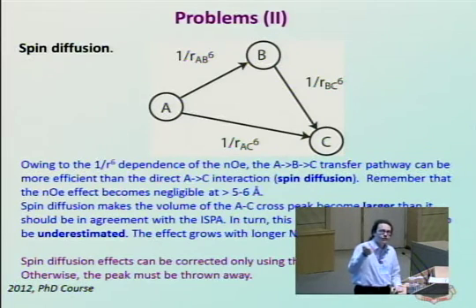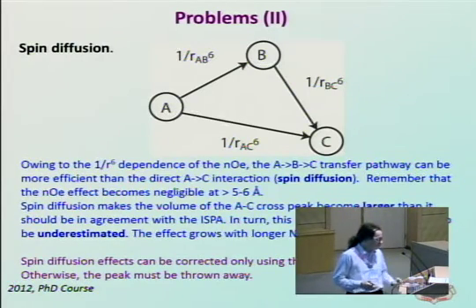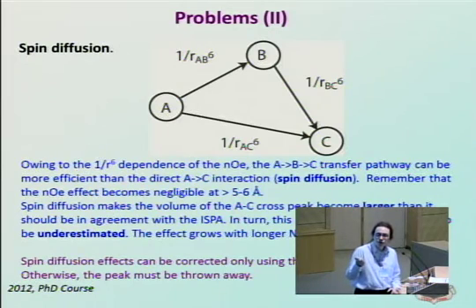And this is very difficult to correct for unless you explicitly account for this kind of phenomena. But if you stick to the 2-spin pair approximation, the only thing you can do is throw away the peaks. And actually, when you do these automated calculations, which are fully automated, as I will mention in this case, the NMR thing, this throwing away of peaks occurs quite often.